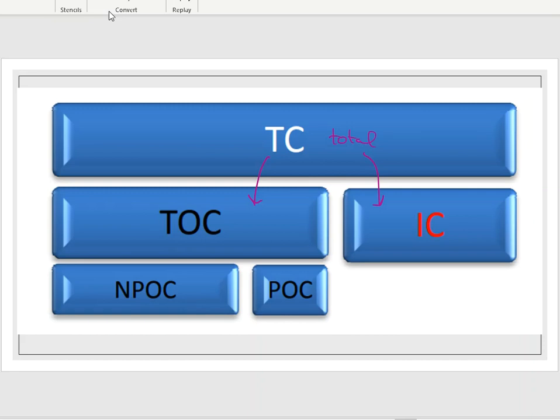The total organic side, we now know how to determine that. If everything is nonmetal across the board, it's a very good sign that it's organic, covalent, carbon-based. And then under that category, there are those that are purgeable and those that are not purgeable. Non-purgeable is NPOC and purgeable is POC. So that is the breakdown. The TOC instrument actually is just measuring this.